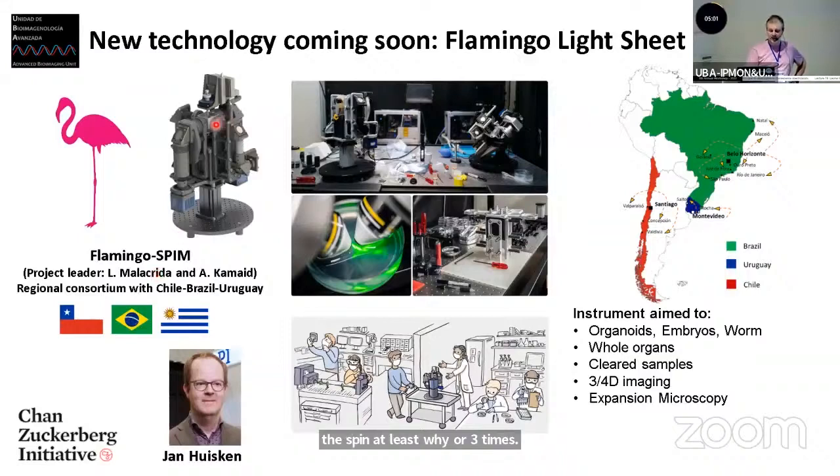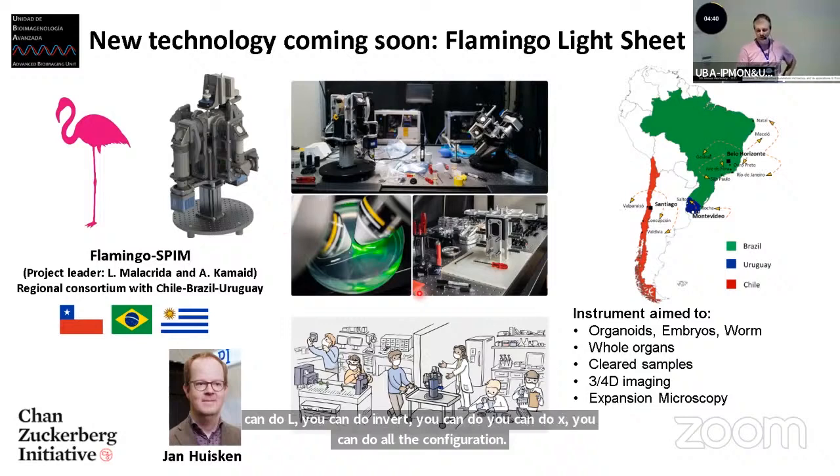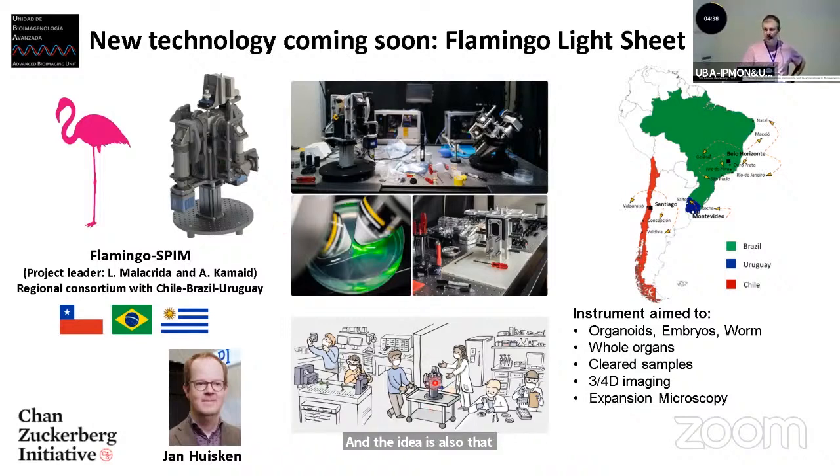And now he has this microscope that is called Flamingo. And it's called Flamingo because it's standing on a single leg. And it's a very versatile microscope, because you can do all this configuration. You can do L, you can do invert, you can do T, you can do X, you can do all the configurations. And the idea is also that it's portable, so you can put this microscope on top of a cart, and you can go from, I don't know, the zebrafish room to the next building or something like that. You can put it in a backpack and drive the car, you know, 200 miles.